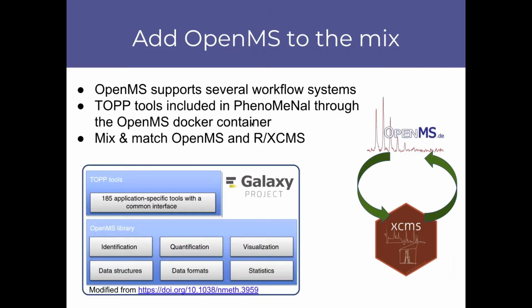And then you need to configure that into Galaxy. And these steps have been done also by Christoph Rutkies and Payam Imami I mentioned before. This allows you to mix and match, for example, OpenMS and the R or XCMS world. So you see here the TOPP tools. There's a large number, many of them dedicated to proteomics, but many of them also applicable to metabolomics. And they are about identification, quantification, visualization, and statistics, and so on.